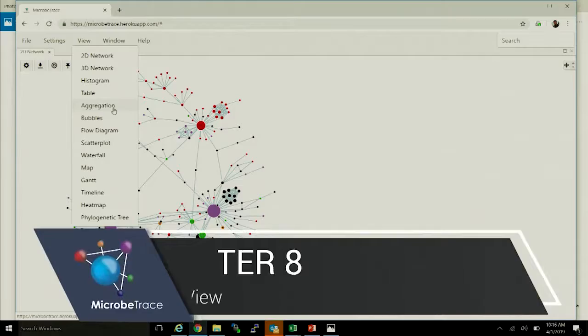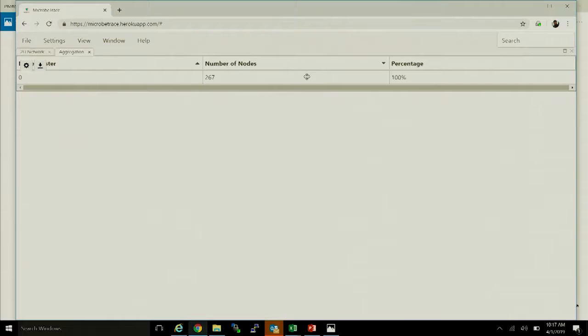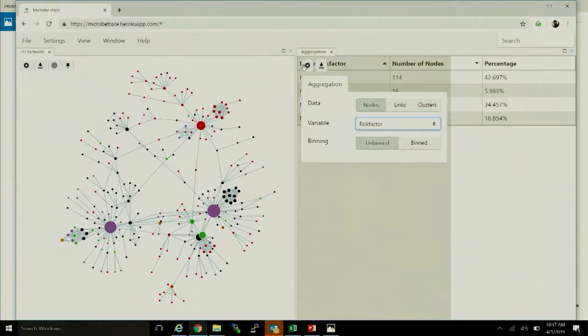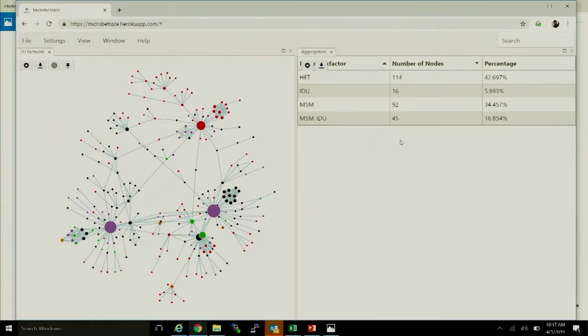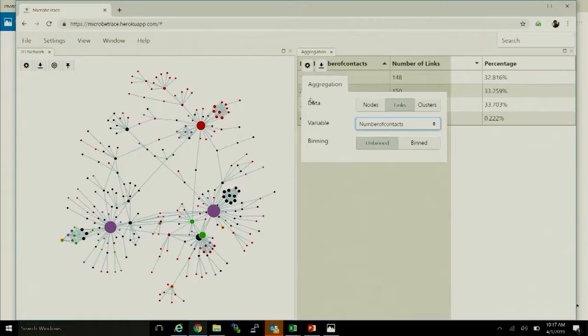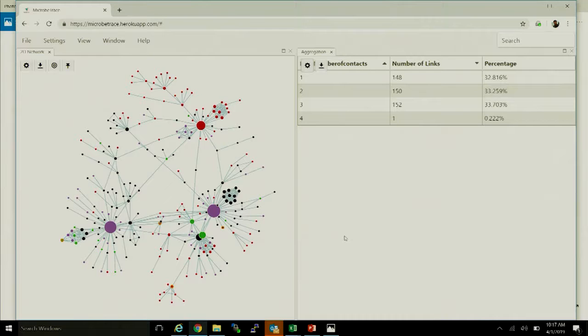In addition to histograms, the aggregate view is a common operation in public health. It puts an aggregate summary alongside the network — for example, aggregating on risk factor immediately gives you the frequency of each risk factor type in the network as well as the proportion of each group. We can also look at link-level aggregations to see the types and frequency of contacts — showing that one person has four contacts while everyone else is in the 1–3 range.